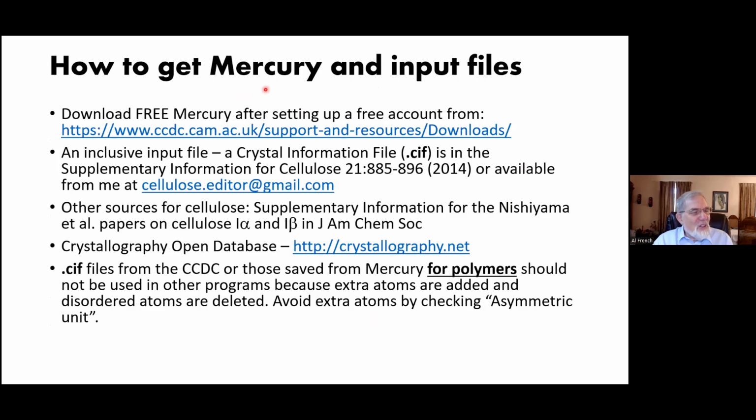So how do you get Mercury and input files for Mercury? Well, you can download the Mercury program for free after you set up a free account at the Cambridge Crystallographic Data Centre. As for the input file, I've published an input file that has all of the different crystal structures of the different cellulose forms that Nishiyama had worked on. You can read this article here in Cellulose and get its supplementary material, or you can just send an email to me at this address.